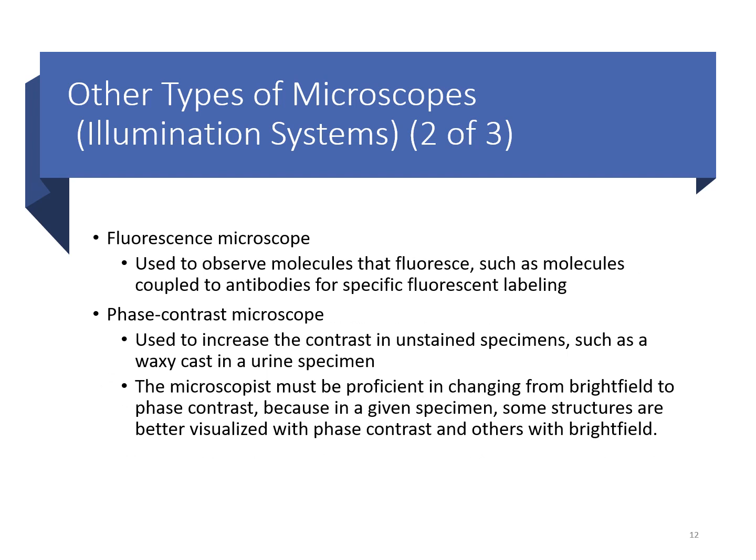There are fluorescent microscopes, and what these do is they're looking for anything that may have been fluorescently labeled. So these will usually be an antibody type fluorescent label, in which you're trying to fix something to a slide and then tag it with a fluorescent label to see if it's present, and then you're looking for a fluorescent glow when you're actually looking at that slide.